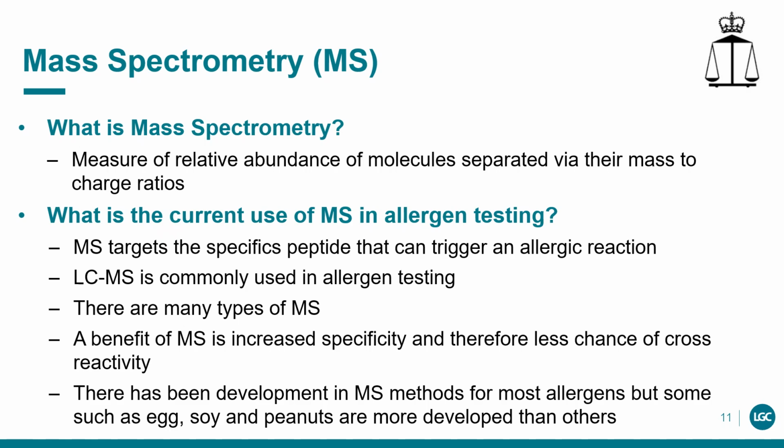MS-based methods that have been used include nano-LC ion trap, MS-MS, matrix-assisted laser desorption ionization time of flight, MS-MALDI-TOF, and single reaction monitoring, SRM-LC-MS.